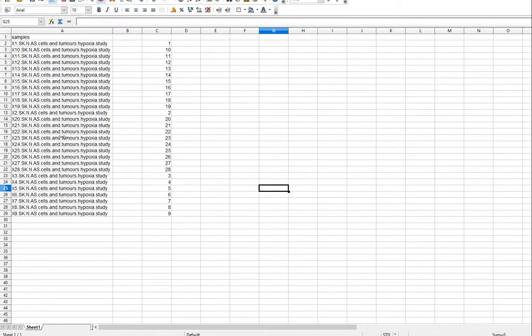Here we can see there is one column that gives us the full title of each spectrum as tameNMR perceives it. What I've done here is add another column in where you can actually see the order of the numbers. tameNMR thinks like a computer, and therefore these are not in the order that we would expect.